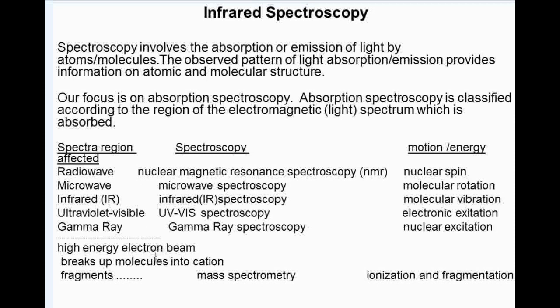Then there is another spectroscopy which technically doesn't involve the absorption of light, but rather the absorption of energy sufficient to break up molecules into ionic fragments. That's called mass spectroscopy.